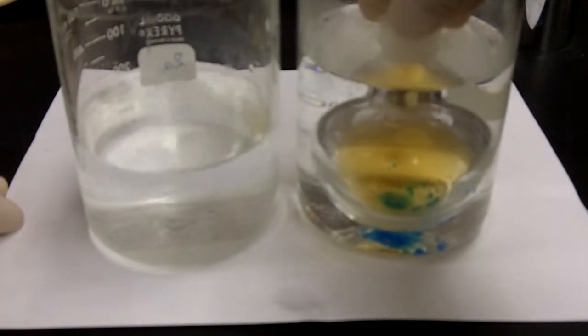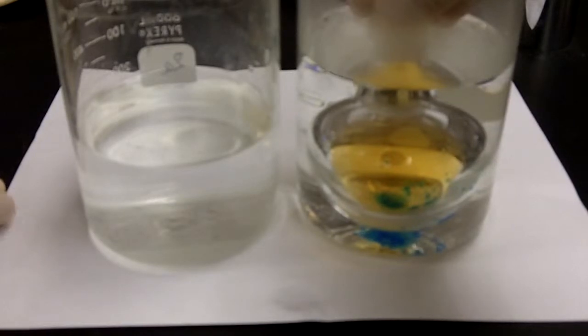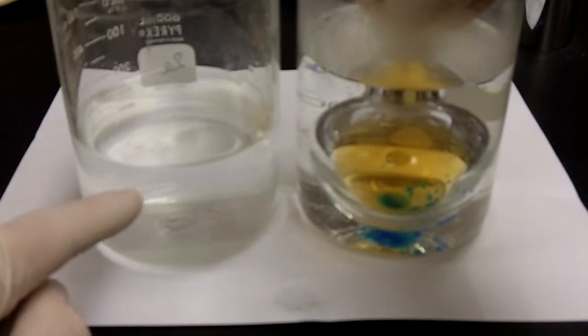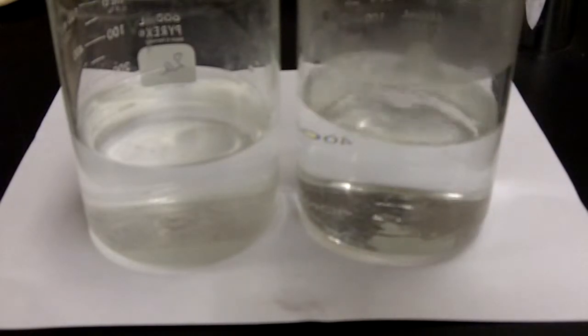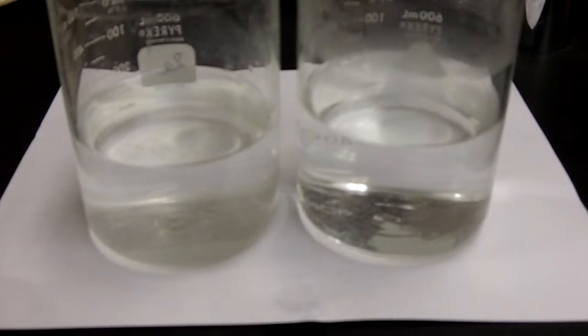Perhaps, if necessary, going back in the video, making a note of the times right before I pull the round flask out of each of the two extremes and then going between each of those two times in the video for comparison. In the data table under demonstration, record the change in the intensity of the brownness, more or less, when it's in the cold and in the hot water. So that was for equilibrium C.